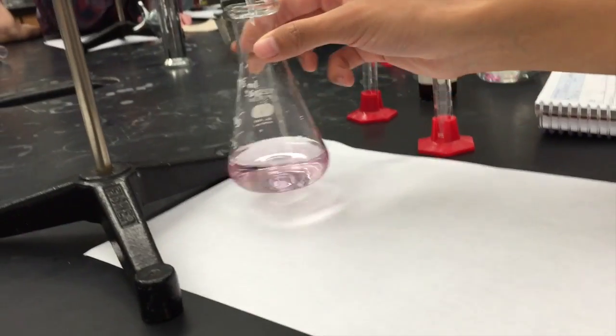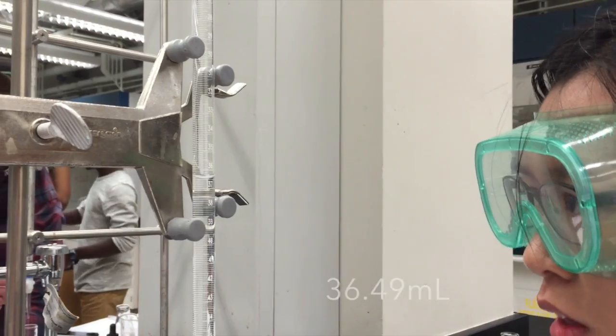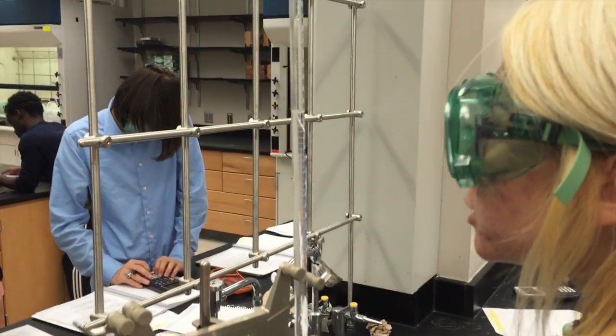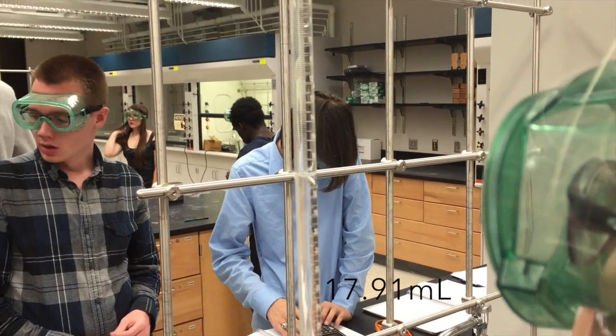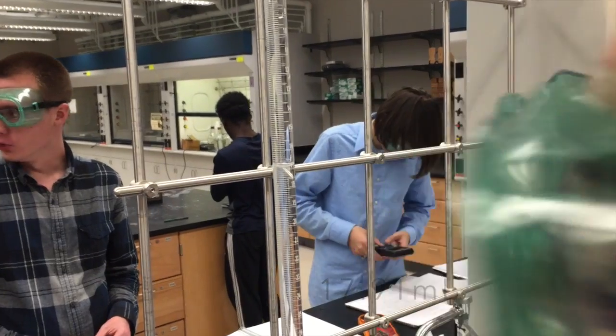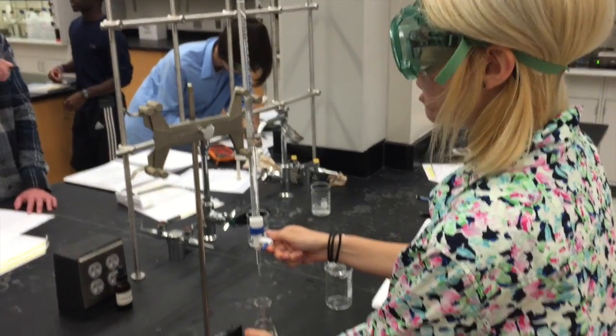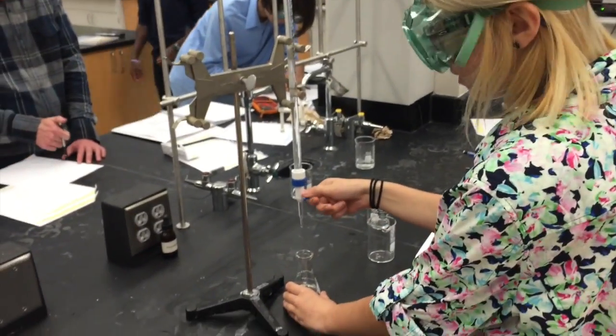In order to do this, you will need to know the molarity or concentration of the titrant before beginning your titration. You will also need to know the initial volume of both the titrant and the analyte. To determine the unknown variable, collect the final volume of the titrant and calculate how much of the titrant was used.